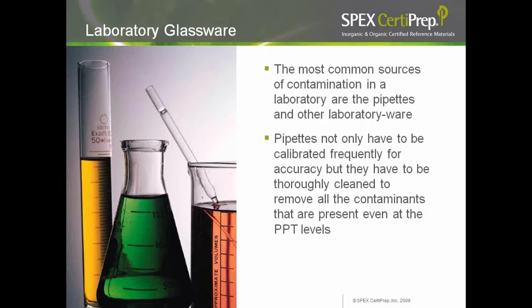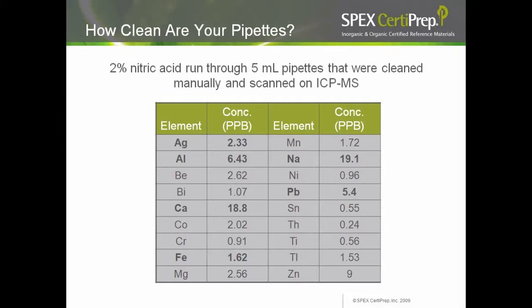So far we have examined contaminants that could come from water and acids. The other major source of contamination is pipettes and general labware. As good laboratory practice, pipettes must be calibrated and thoroughly cleaned, with cleaning procedures ensuring freedom from contaminants even at PPT levels. Pipettes have a memory effect — remnants of what you pipetted before show up in later use even after thorough cleaning. To demonstrate the effect of manual cleaning, we scanned a 2% high-pure nitric acid for impurities after delivering it through a thoroughly but manually cleaned pipette.